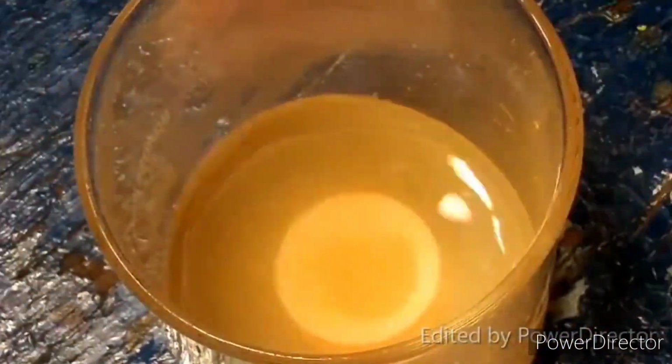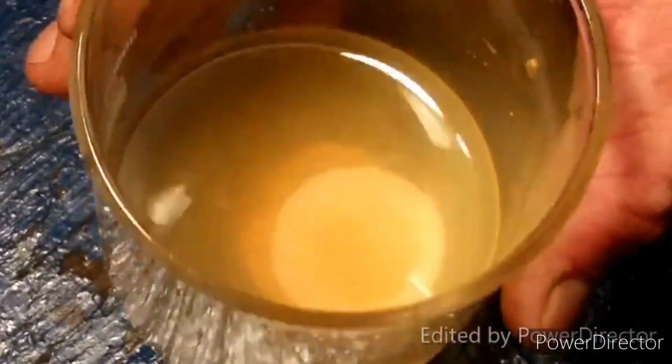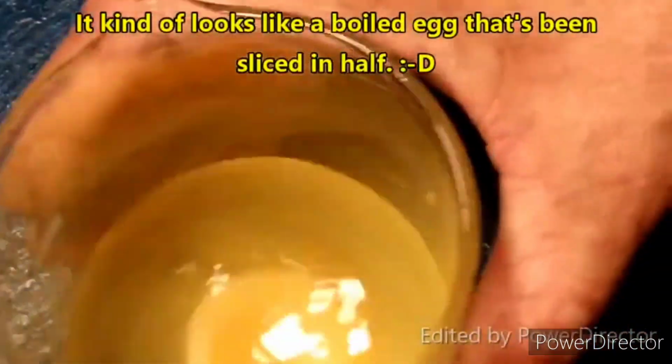As the salt is dissolving, we're getting this bright orange compound. And I do not think it's the uranium trioxide we started with. For one thing, all the big chunks that were in there aren't in our product.